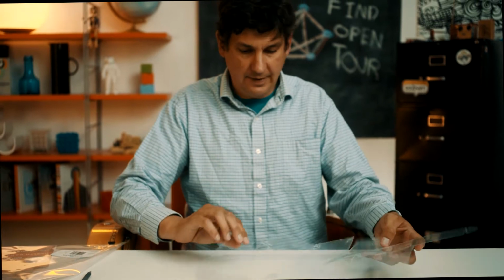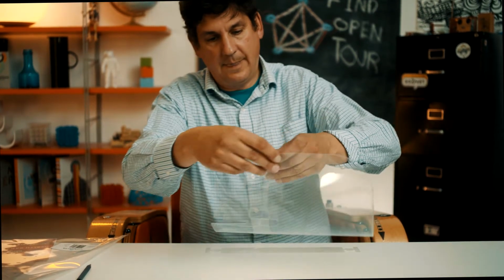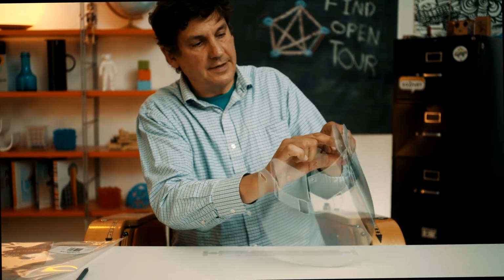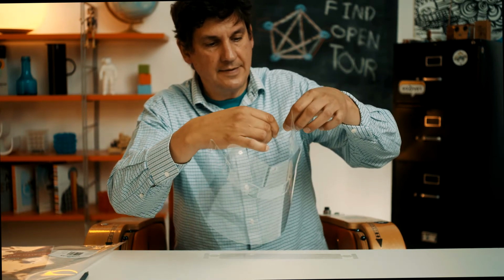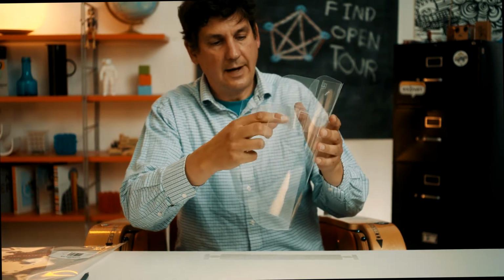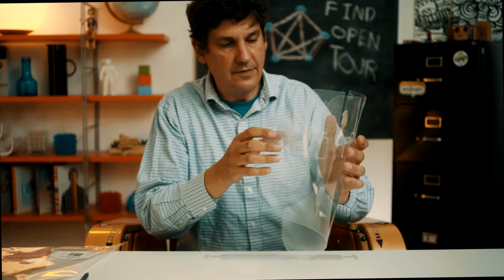And so step 2 is we're going to now take the rounded portion of this strap 1 and we are going to insert it on the opposite side right into the middle. There's 3 slots, and if we put it in the middle one, that's probably best for most people. And you just put in this little rounded hook into there, and what this does is it creates kind of a nice comfortable forehead placement for the face shield.